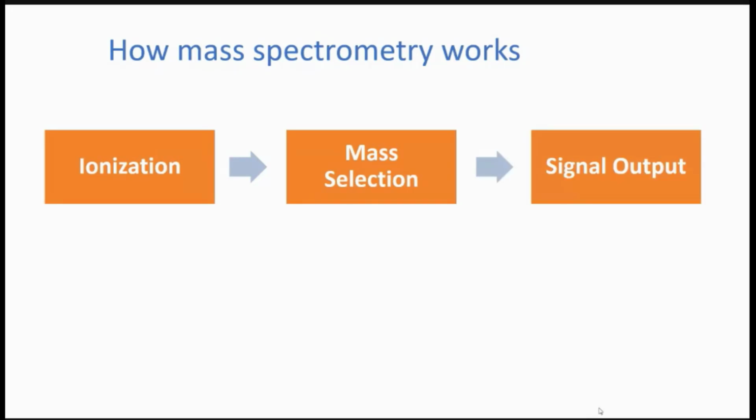And then there is an output signal. A lot of people think the mass spectrometer is the detector, but in fact it is not, although it incorporates a detector at the very end of the process. Something measures ions as a charge as they hit a detector plate at the very end, and converts that into an electronic signal.